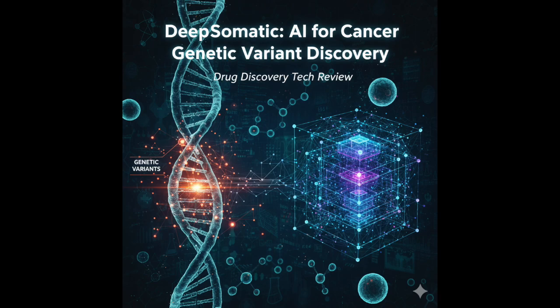Okay, so they do the biological challenge, they do the data challenge. Now let's get into the machine itself. How does DeepSomatic actually work? You said it turns this into an image recognition problem. That's the core idea, inherited and adapted from DeepVariant.